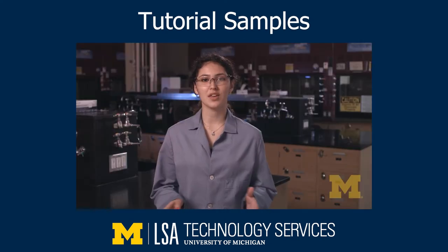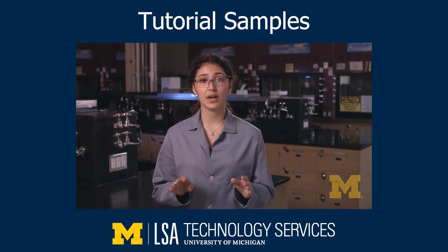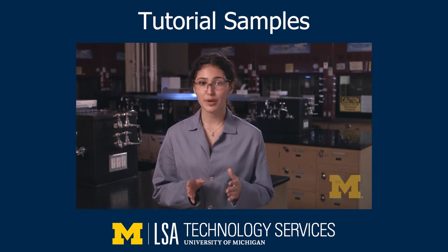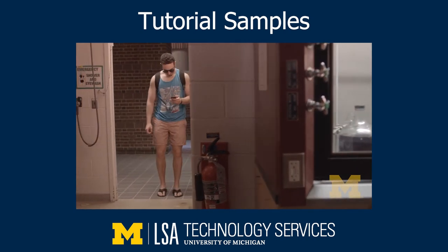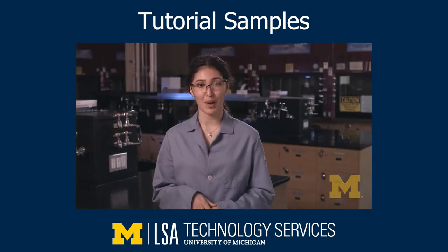The most important thing you will learn in chemistry lab is laboratory safety. Whenever you are in the lab, you are expected to conduct yourself in an appropriate manner and adhere to all rules. Appropriate lab attire is required whenever working in the lab. If you want to wear sandals and shorts on your way to class, that's fine. Just throw a pair of pants and shoes in your bag so you can put them on when you arrive.